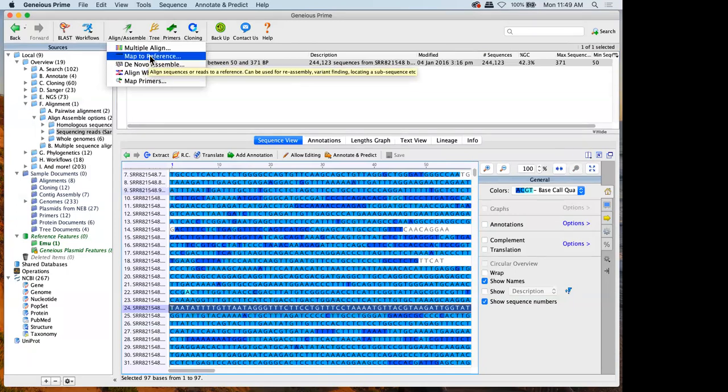These particular tools are designed to work with Sanger sequencing or NGS data. The advantage of them is they understand that your reads may have contamination in them, so they'll throw out anything that's too dissimilar from your reference or too dissimilar from each other. They also understand things might be sequenced in different directions, so they're going to automatically flip sequences if they need to.